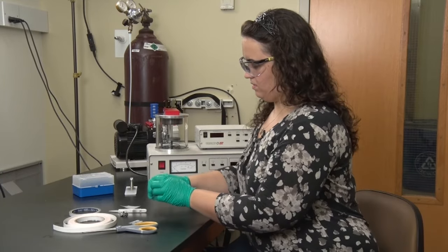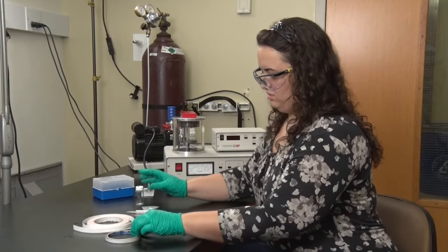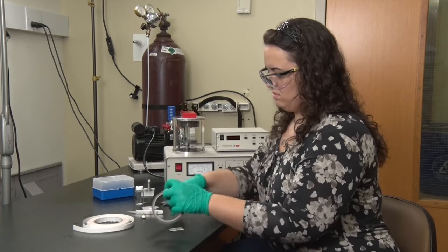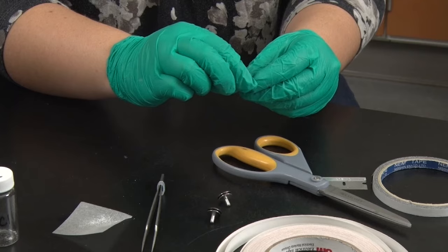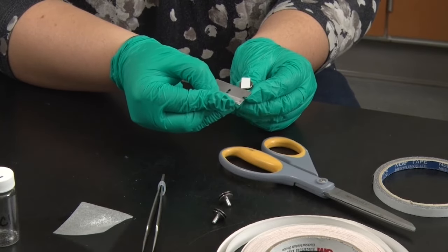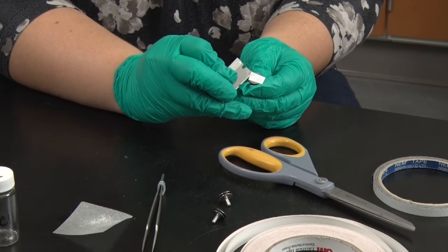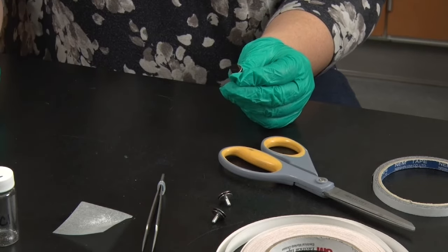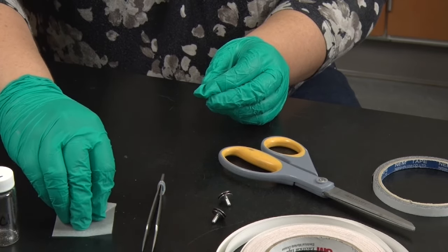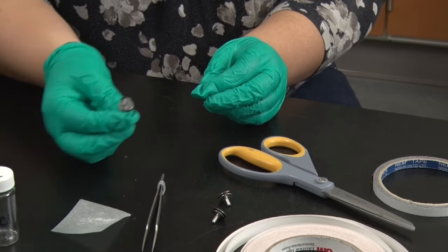First, I'll mount the sample onto a sample stub with some conductive tape. The tape I'm using is double-sided carbon tape, and I'll use it to hold the salt in place. By gently tapping the sample stub on the table, I can remove any excess salt that is not well attached.